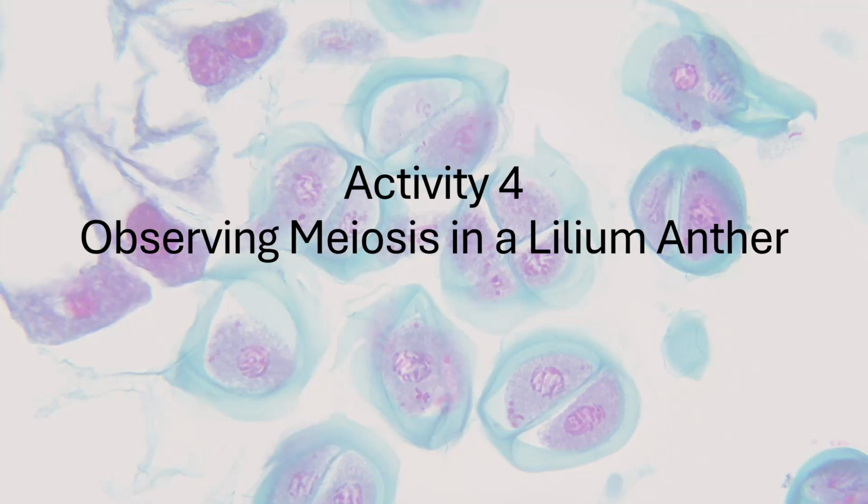In this activity, you will observe real plant cells undergoing meiosis inside the anther of a lily flower. Unlike our paper models, these are actual reproductive cells preparing to form pollen. Because many cells in the anther divide at the same time, this tissue provides clear, synchronized views of meiotic stages.